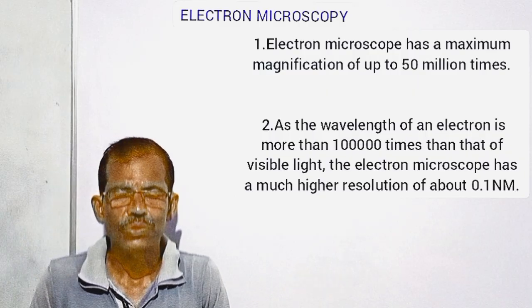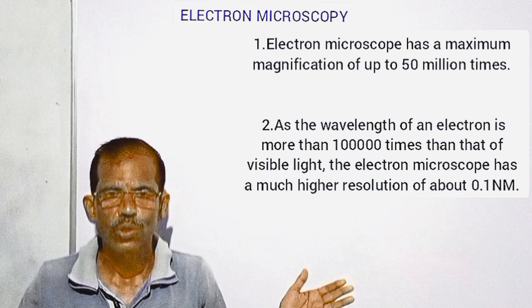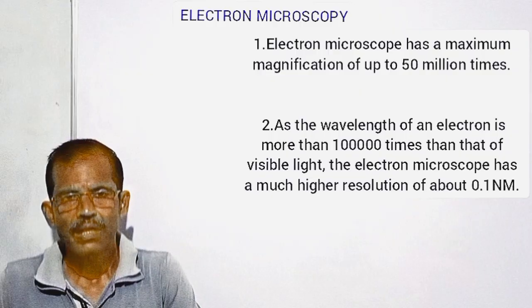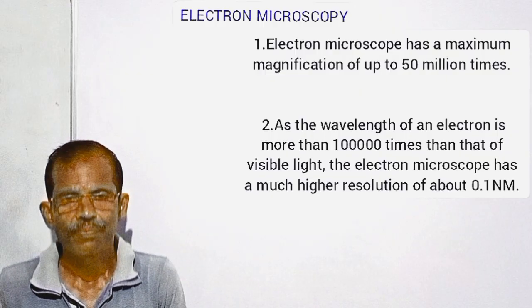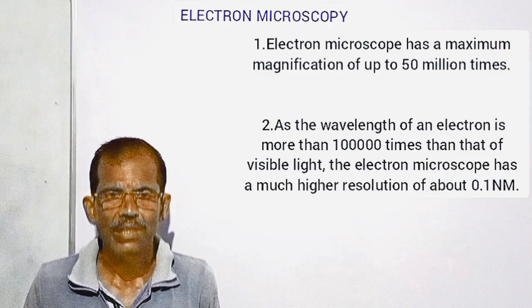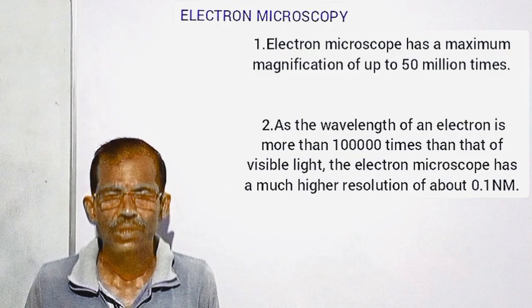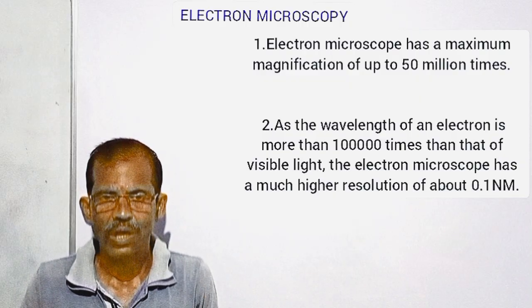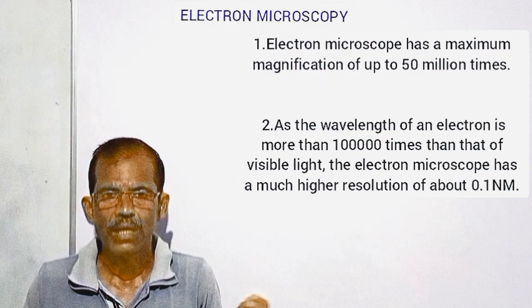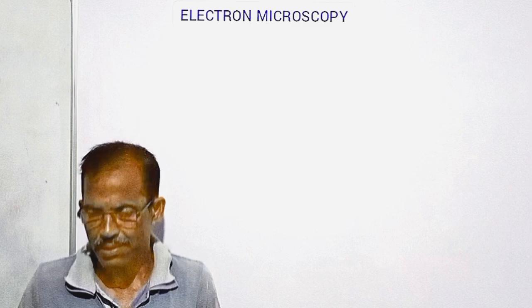It includes quality control, forensics and geology. Electron microscopes are widely used in quality control, in identifying evidence such as gunshot residues, fibers and other biological particles at the crime scene, and also to analyze the chemical composition of soil and rock samples.